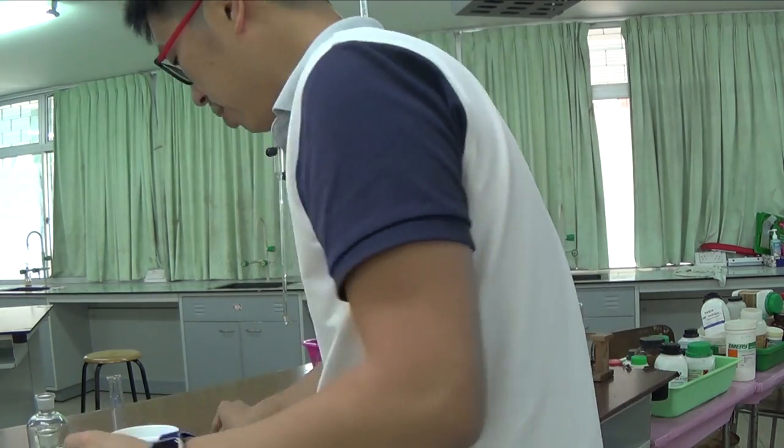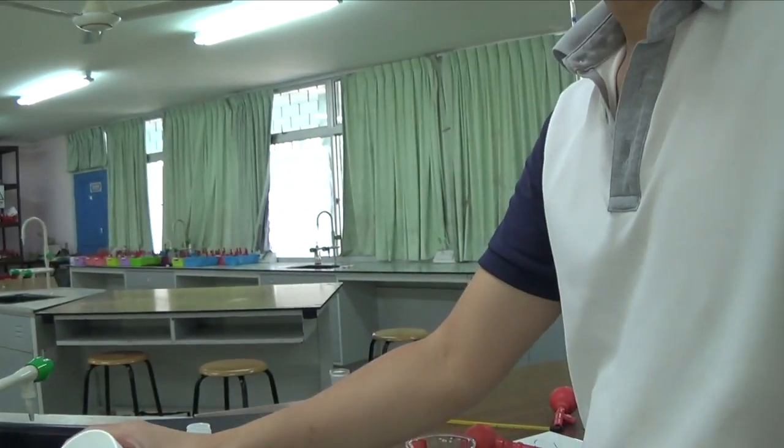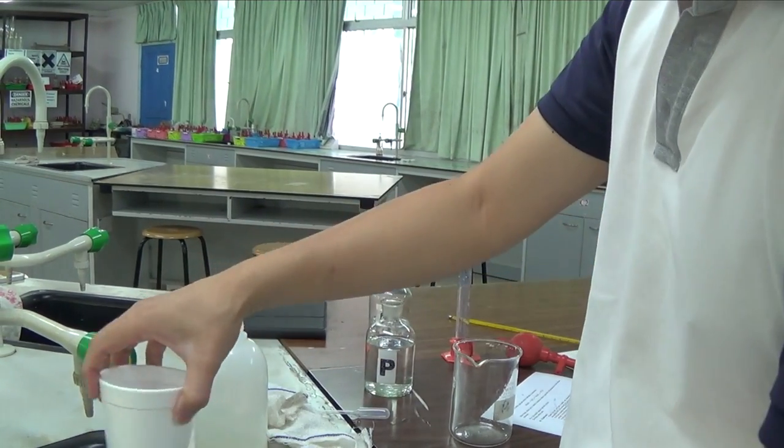Then mix it up. And then what I'll do is I will chuck the styrofoam cup content into there. And then just rinse with water. Distilled water, not just any water.